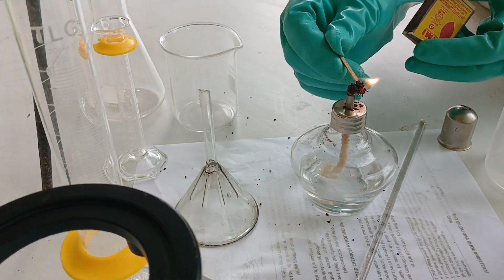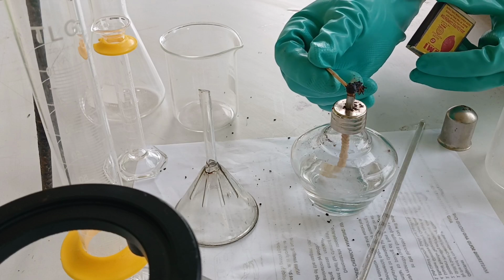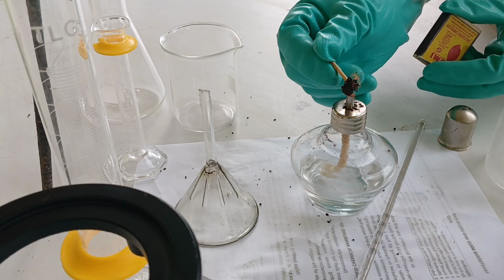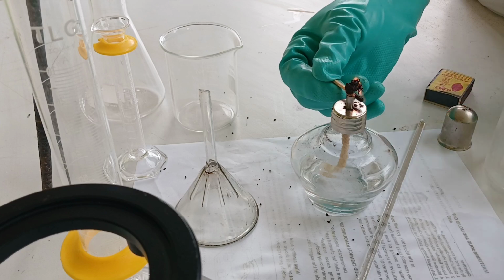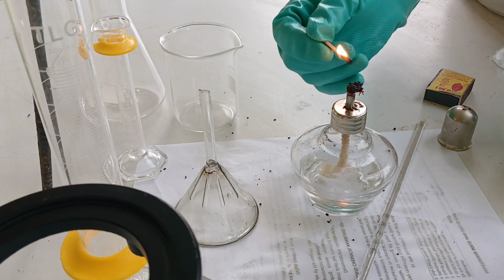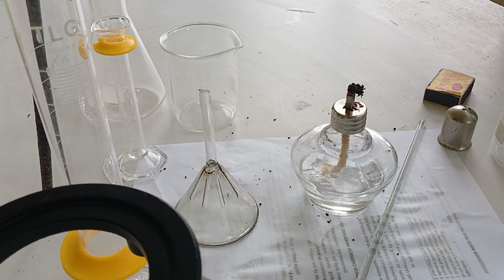As you can see, dili siya adapt sa fire because the denatured alcohol slowly goes upward pa. It's not yet totally penetrated up to the tip. So what I did is I put a small amount of the denatured alcohol on the tip so that it would easily flame or catch fire.